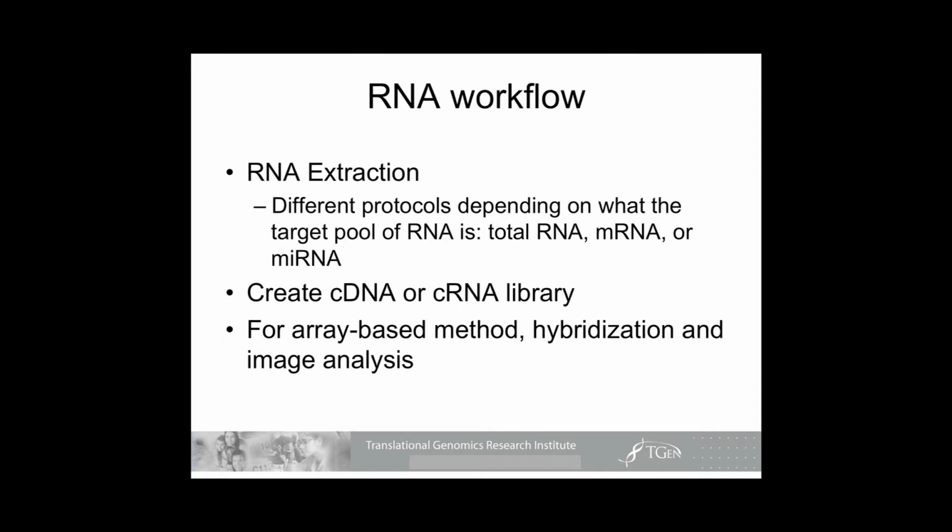So an RNA expression workflow begins with RNA extraction, and you're going to have different protocols depending upon what you want your starting library to be. If the target pool of RNA is total RNA, so you want to get everything, you're going to use a different extraction protocol than for mRNA. For an mRNA, you're probably going to do a poly-A enrichment, which means you're going to miss a lot of non-coding RNAs. So you need to keep that in mind as you think about the information you are working with. And microRNAs require an entirely different protocol.